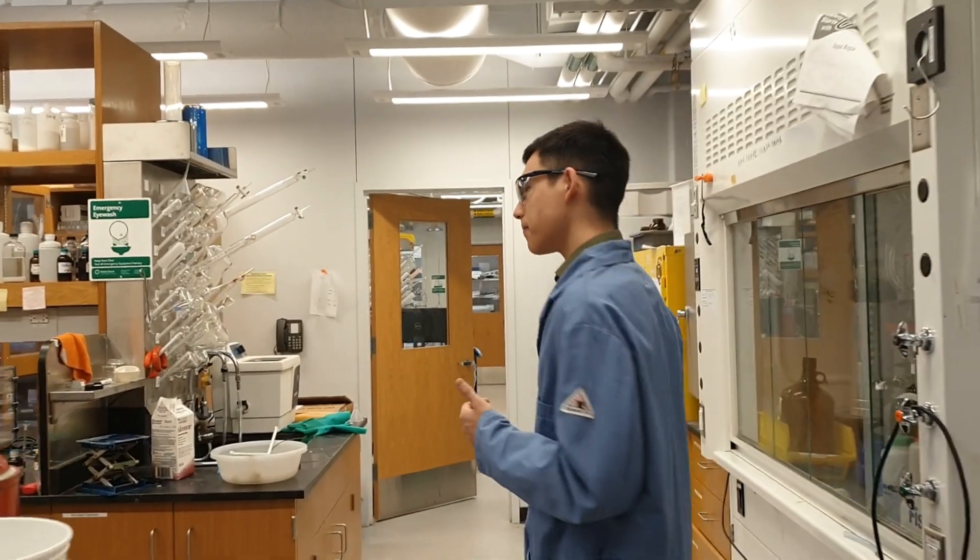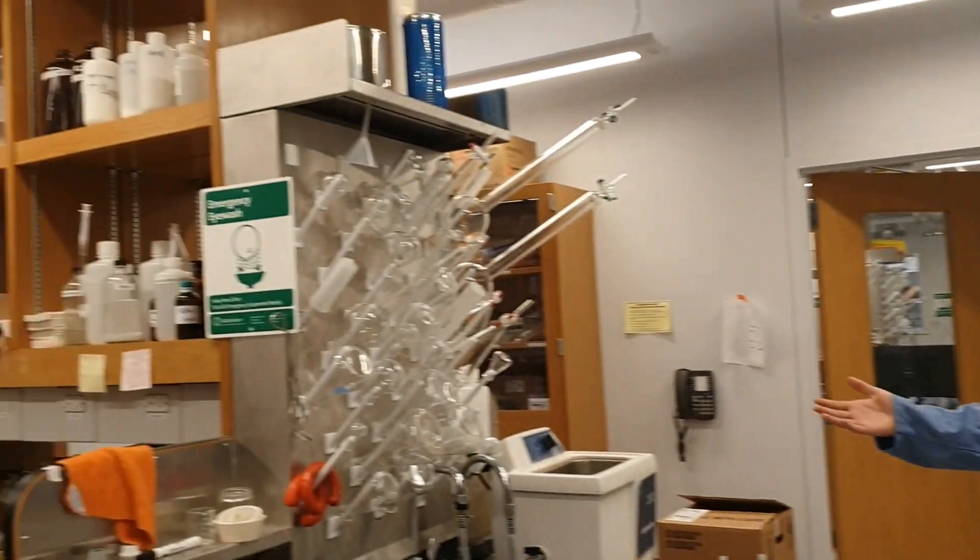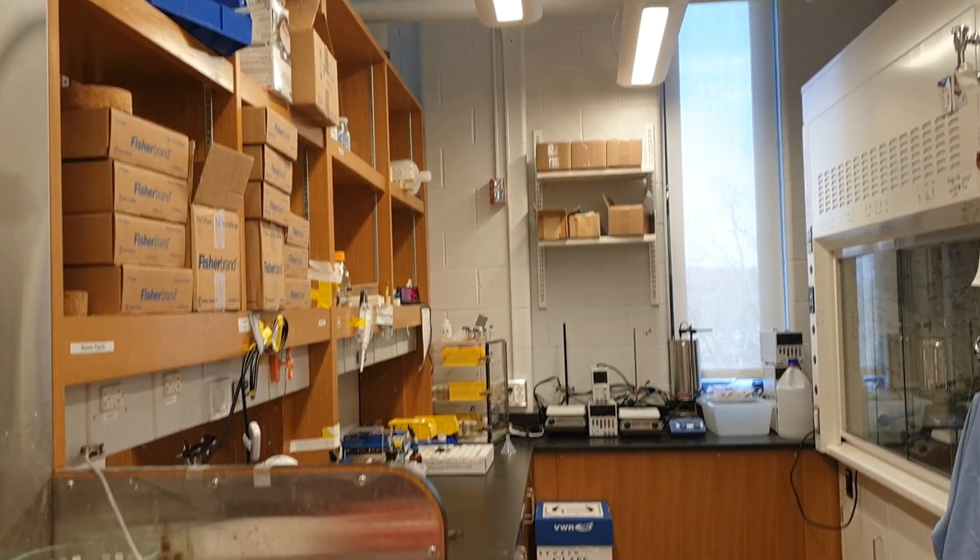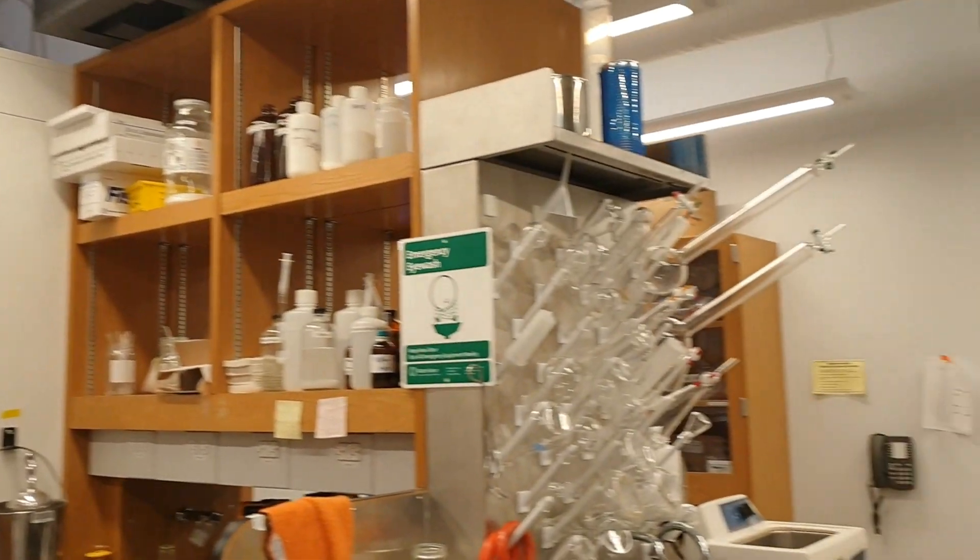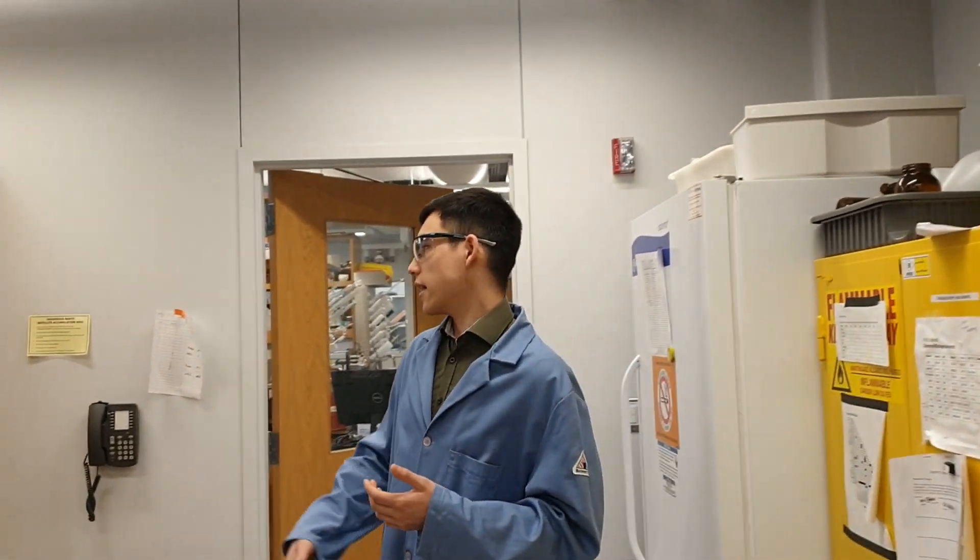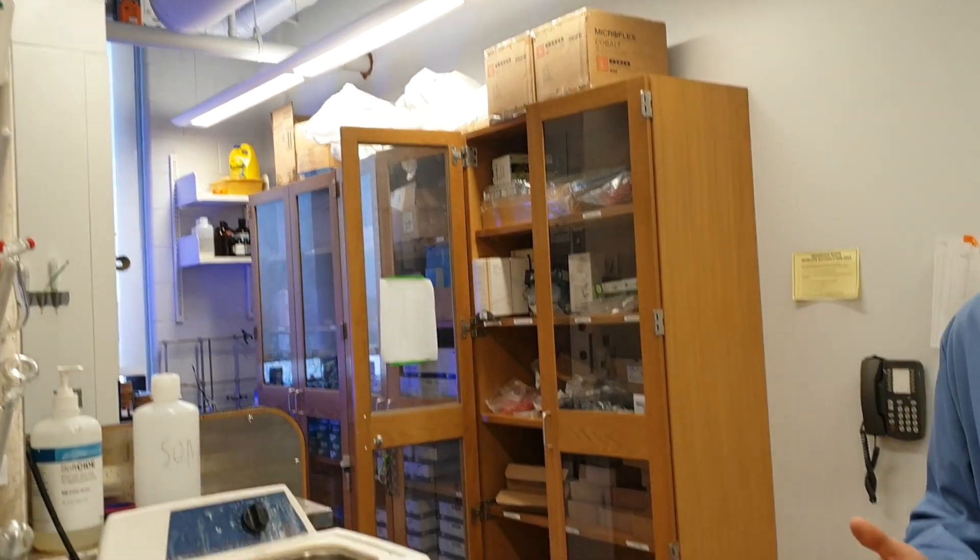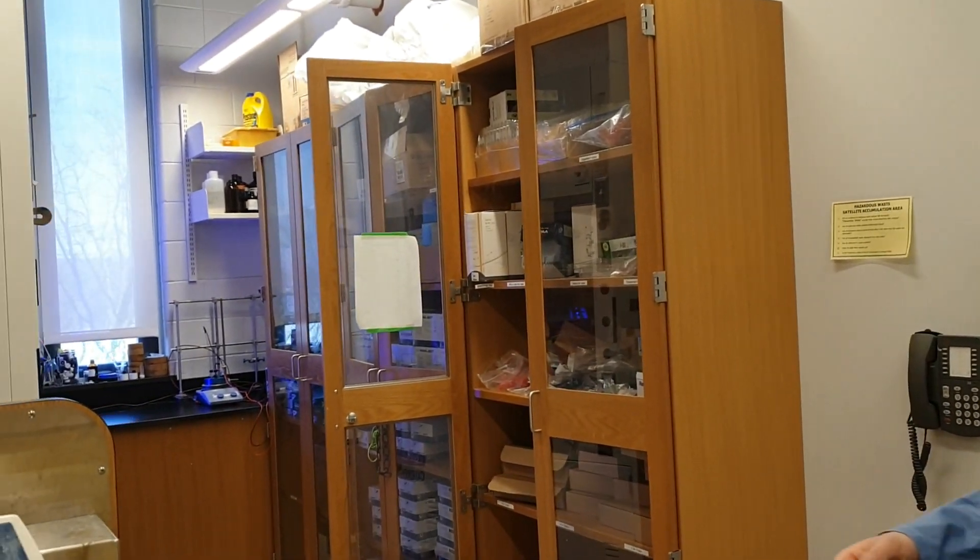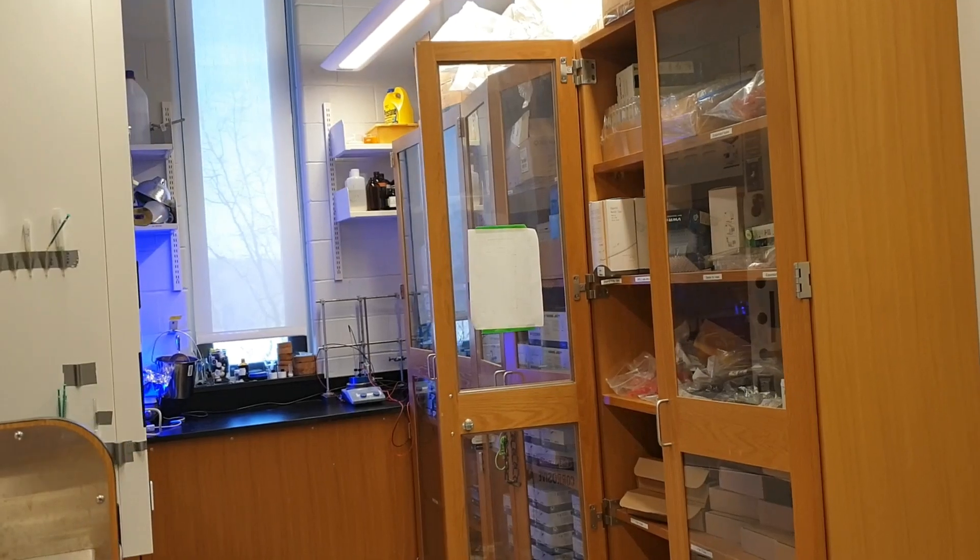Let's go ahead and show you our glove box and our solvent system. Here you see a lab space set up in a very different fashion, or similar setup, but different fashion. You see our storage of our daily supplies, such as syringes, needles, septa, vials, and that kind of stuff.